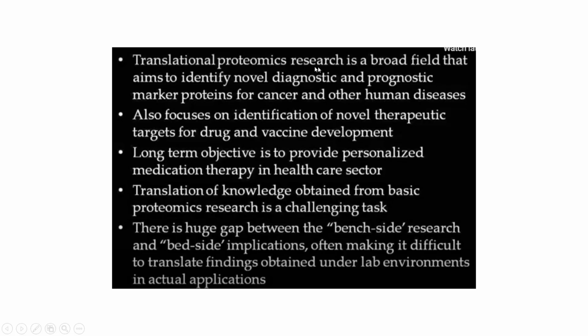So this is translational proteomics research. These are different applications of the same. In terms of translational proteomics, it aims to identify novel diagnostic and prognostic markers that can be identified using this technique. It can help in the identification of novel therapeutic targets as well. If you have a certain long-term objective, it is personalized medication therapy in terms of healthcare. So all this can be achieved by using the MALDI-TOF technique or the LC-MS technique.